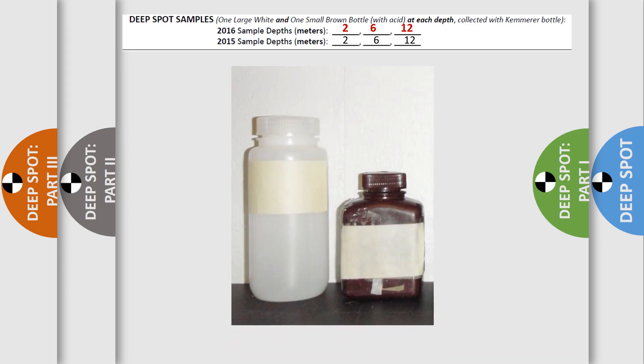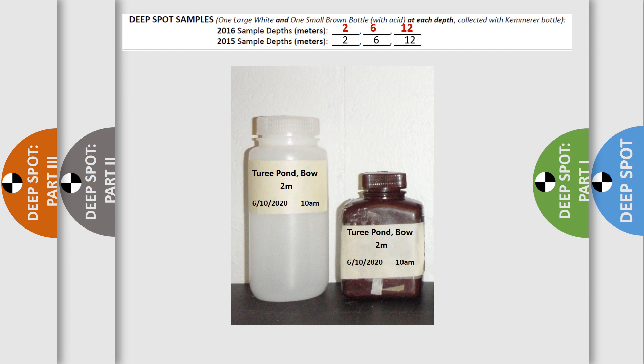Next, label your sample bottles. You will fill one large white bottle and one small brown bottle from each depth. This is a set of samples.